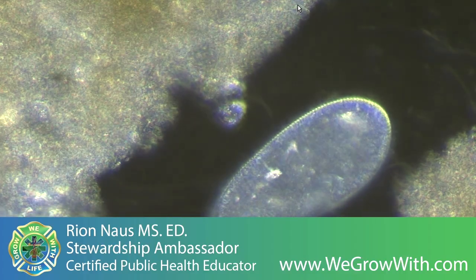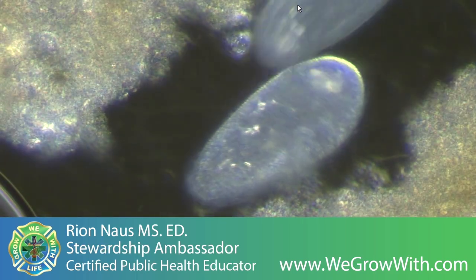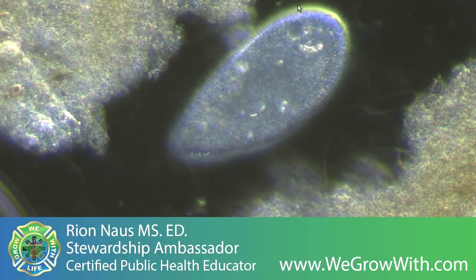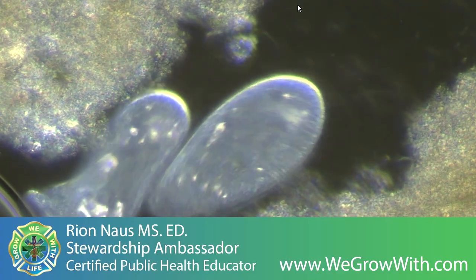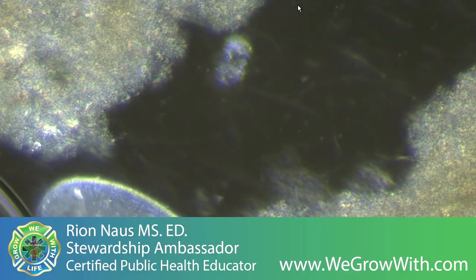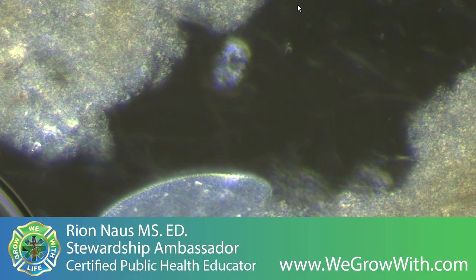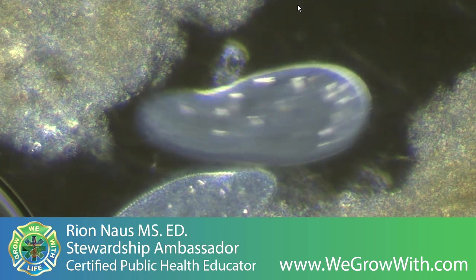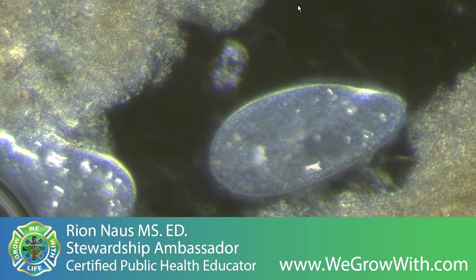So now we're at 400 magnification. You can still see some bacteria swirling around the ciliate. We want to watch the membrane exterior and the inside as it goes into that protective state. So these ciliates are part of a diverse group of single-celled organisms called protozoans. The hair-like structures called cilia, which they use for movement, feeding, and sensing their environment.